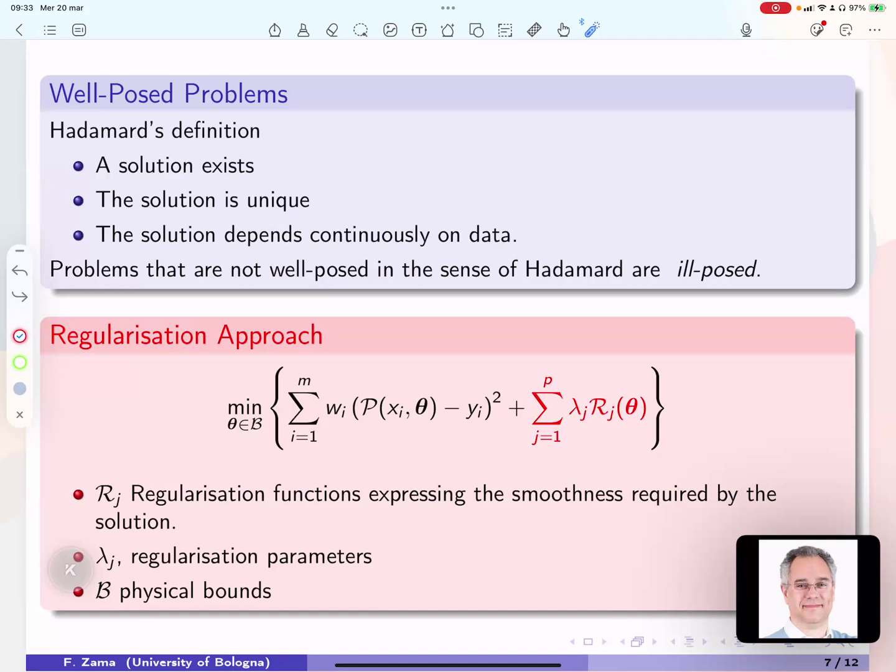In our software, we introduce regularization parameters, so we have the possibility to introduce more regularization functions. So we have a linear combination of regularization parameters and the regularization function. The idea of all these functions is to somehow damp the effect of the presence of noise, or avoid that the presence of ill-conditioning spoils and dominates the solution. Of course, the different types of regularization depend much on the problem and on the property that we want to see in our regularized solution.